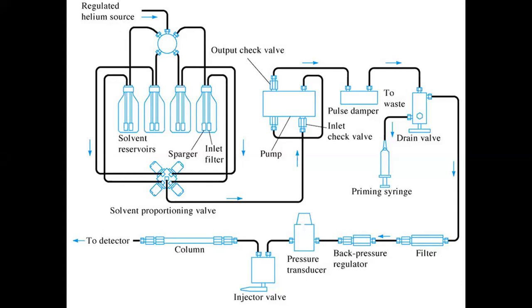So the activity of these things will be destroyed. That's why the purging is very, very important. And this process is called degassing.